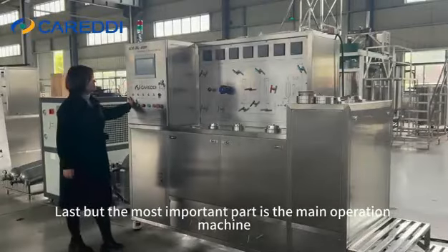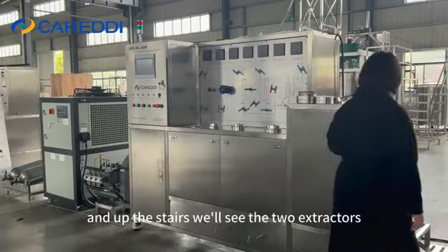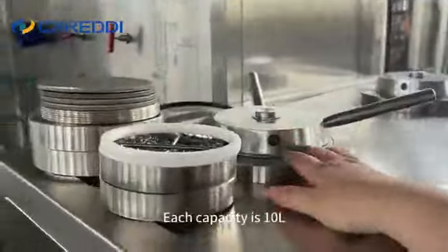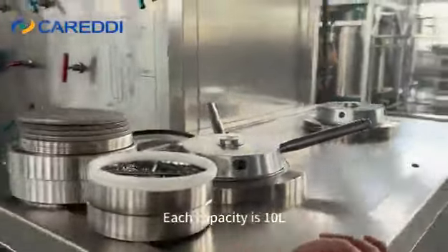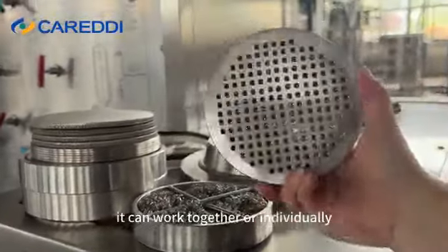Last but most importantly is the main operation machine. And up the stairs, we'll see two extractors. Each has a capacity of 10 liters. This is where we put the raw material, and they can work together or individually.